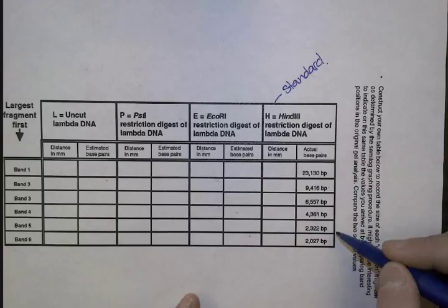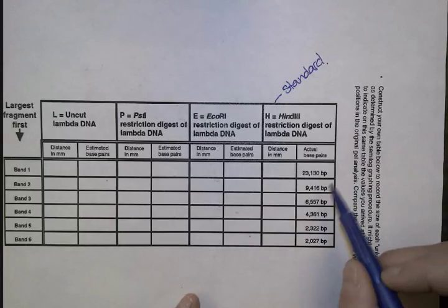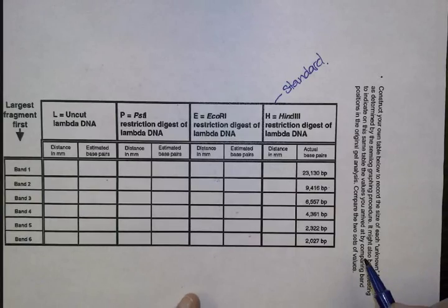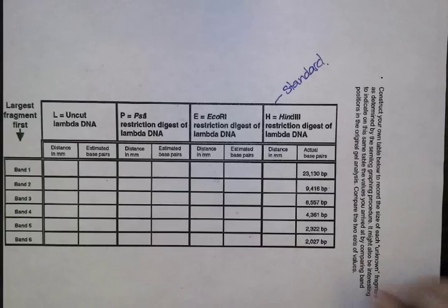And so we'll have to take a look at that. The first thing I want you to do is take a picture of your DNA fragments, and then print those pictures out and tape them into the slot on your packet from online. Okay, so I want to see that. Sometimes that's actually the best way to measure your DNA fragments, is to take a picture and then measure off of your phone. Just make sure that you're always at the same zoom when you're measuring all of the band fragments. Or you can measure right off the gel, but I do want to get a picture of that.